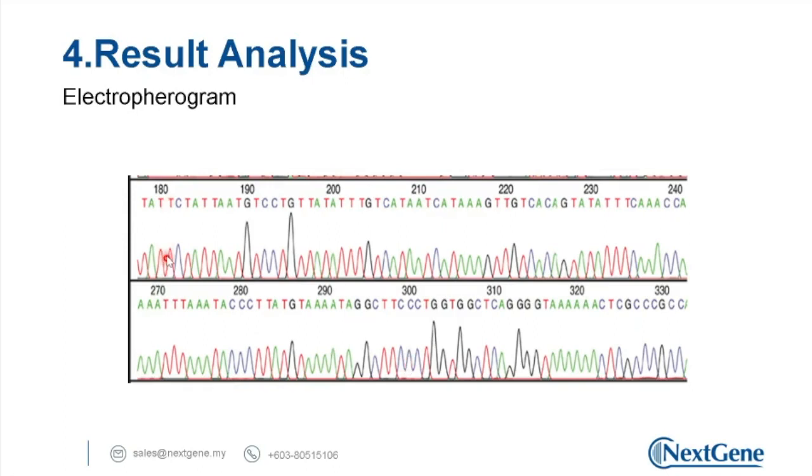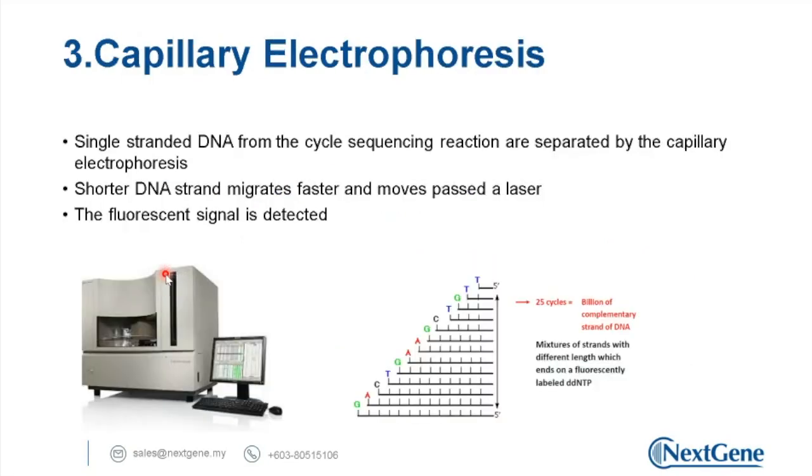This is the fragment with the size of 181, okay? And the last base is actually a T. And of course, when we're talking about this fragment passing through, it will not be only a single fragment. There may be 500, 1000 copies of this particular size fragment with a single T there. There are many copies of this particular fragment with this size, all of them ending with a T.